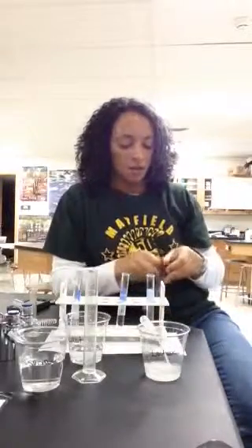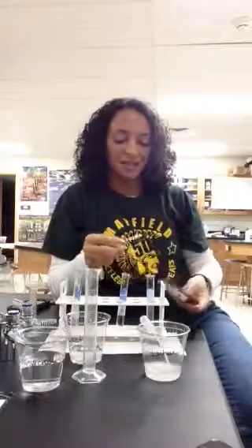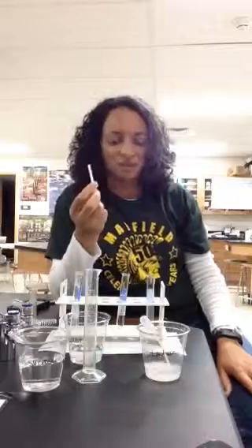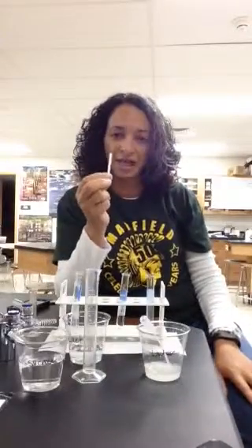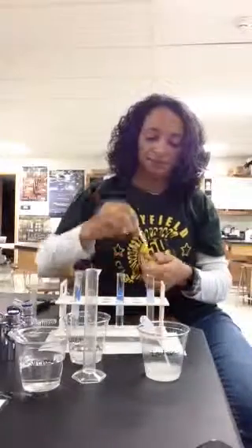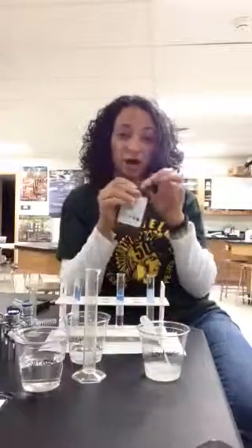At the end of that time, I'm going to get my glucose test strips. Now you will notice when you pull these glucose test strips out that they are actually yellow, not aqua, like the lab packet says. Different glucose test strips are different colors. So I'm going to take a test strip, and I'm going to quickly just dip it in so it touches just my lactose. I'm going to get another one, and I'm going to dip it in to my lactase mixture, and I'm going to let those sit for 3 minutes. That's how long the package says you have to wait before you can read to see if glucose is present.